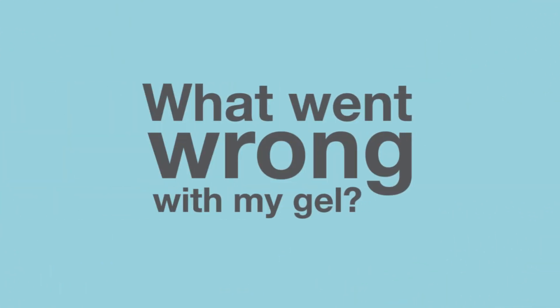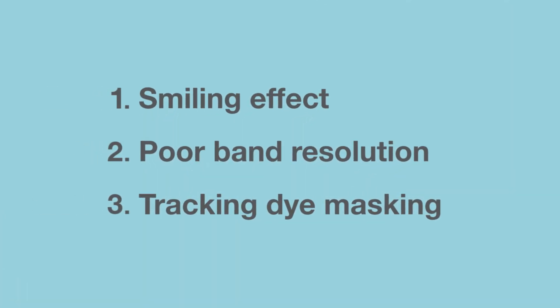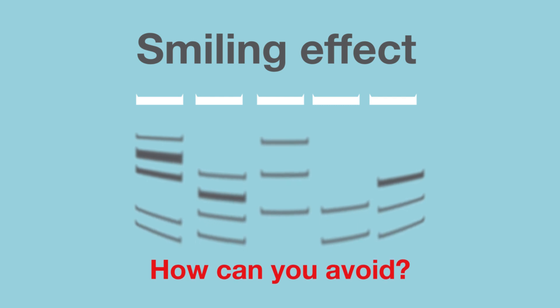When performing nucleic acid electrophoresis, the last thing you want is unclear results. Here's how you can solve three of the most common problems. Smiles are good, but not in your DNA bands after gel electrophoresis. How can you avoid this smiling effect?